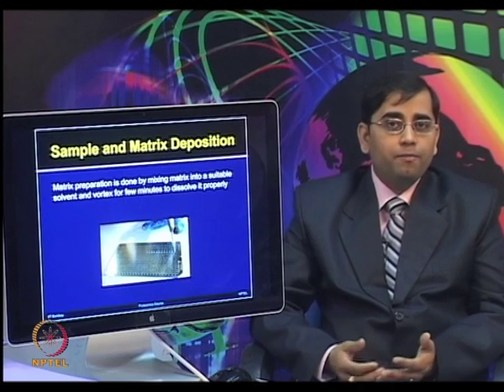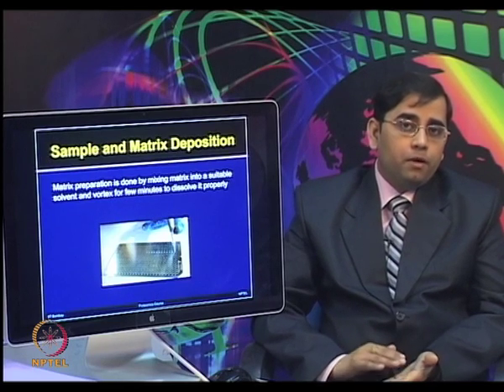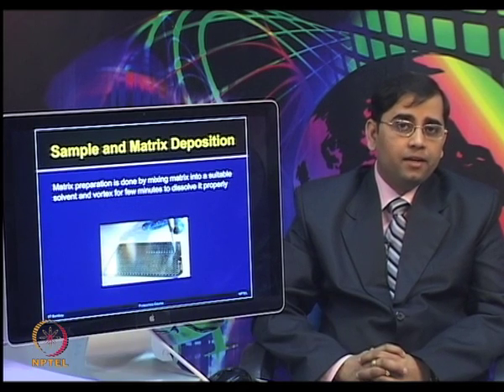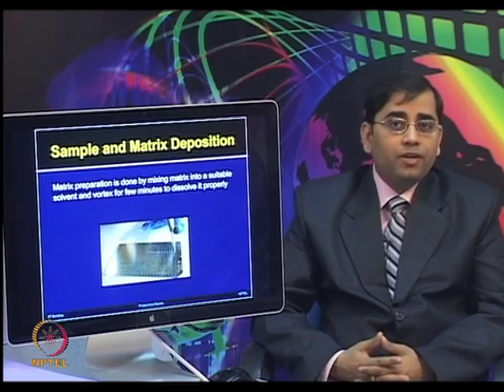So, that you have enough matrix below and above the analyte. So, one can try different combinations of placing the matrix and the analyte, and then once you have placed all of this sample of interest on the MALDI plate, you are ready to dry the target plate.